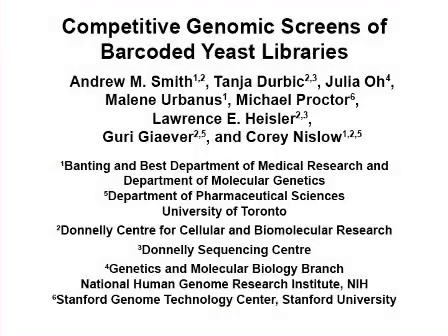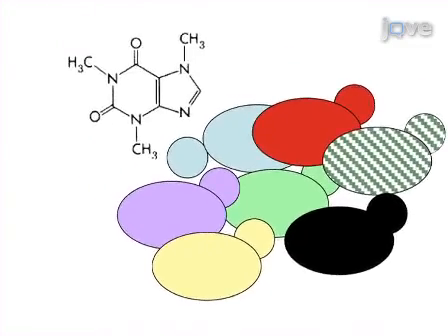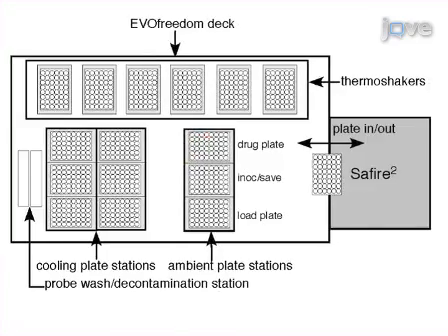The overall goal of the following experiment is to use genome-wide barcoded microbe collections to understand gene-drug and gene-environment interactions in a highly parallel manner. This is achieved by screening the microbe collection for 5 to 20 generations of growth in the presence of a drug, using robotics to maintain the cells in exponential growth.